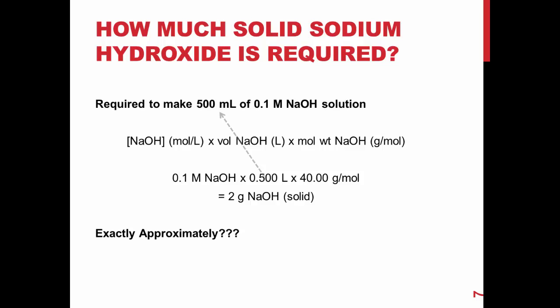"Exactly approximately" means that you must have approximately 2 grams, but you must know exactly how much you have. You do this by weighing around 2 grams of sodium hydroxide on the analytical balance.